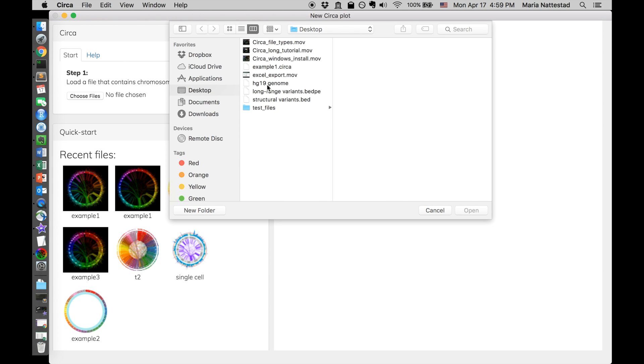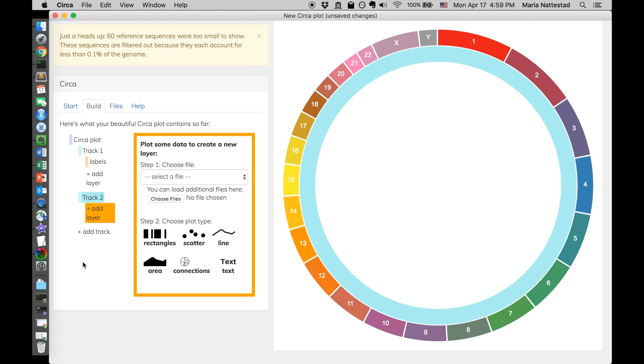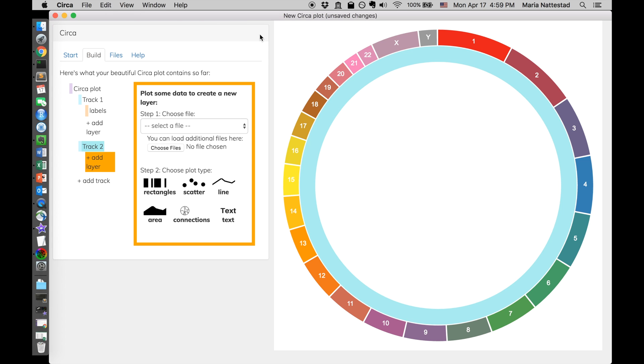So I'm going to pick our genome file. And chromosome and size are chosen correctly, so I'm going to hit submit. This just tells me about alts that are too small to show, but I've got all the big chromosomes that I want to visualize here.